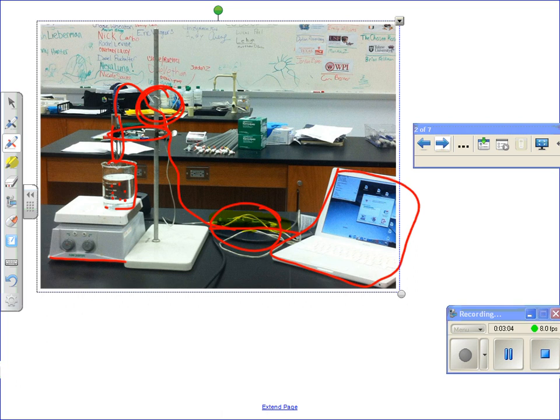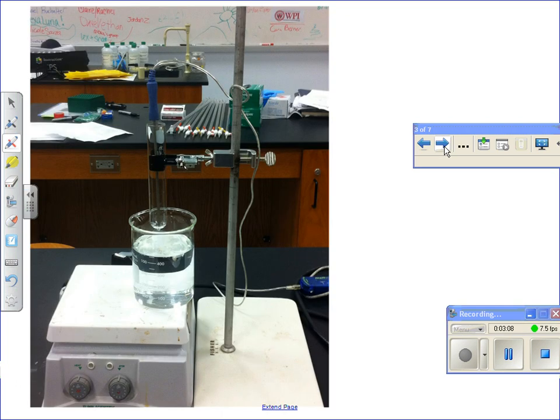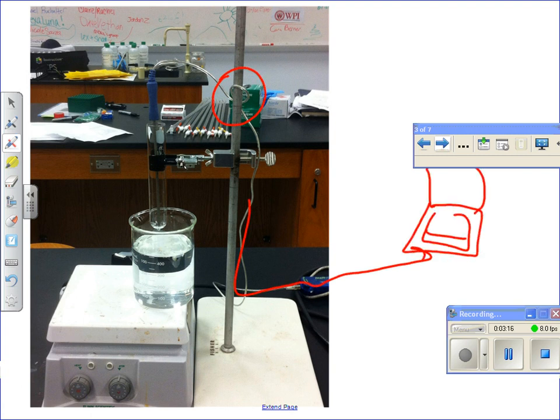So you're going to set this up. It's actually going to look like this in a closer view. If you notice, you see the wire wrapped around there, dropping down on the side and hooked up to the computer over here. Here's an artist rendition of a computer. I know it's fancy. There you go. Then what you're going to do is put your solute, your BHT, in the bottom of the test tube right here. We're going to submerge it in a hot water bath, which will liquefy it.